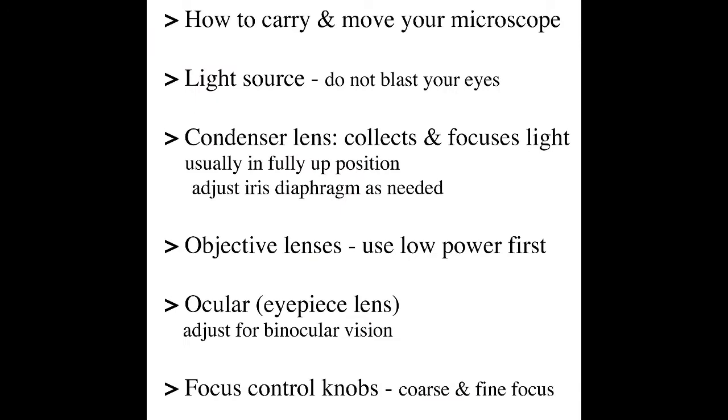Your microscope is a delicate and fairly expensive piece of equipment, so handle it carefully. If you're going to move it around, carry it with both hands, and don't drag it across the bench. That vibration will throw the optical elements out of alignment, so pick it up if you're going to move it from one side of the bench to the other. When you turn your microscope power on, have the voltage set at the lowest level. You don't want to blast your eyes out with light when you look through the microscope, and you can bring the light intensity up to a level that's comfortable to look at.